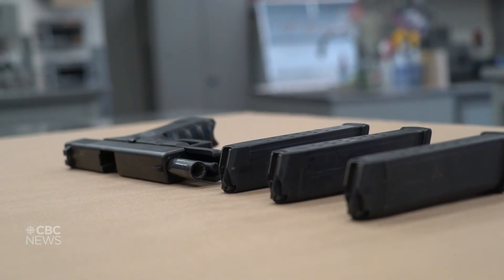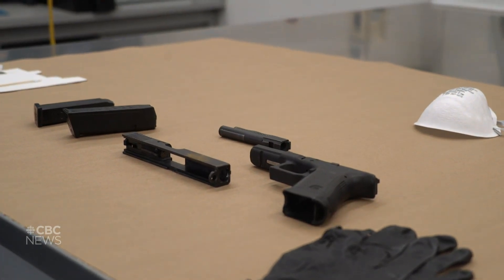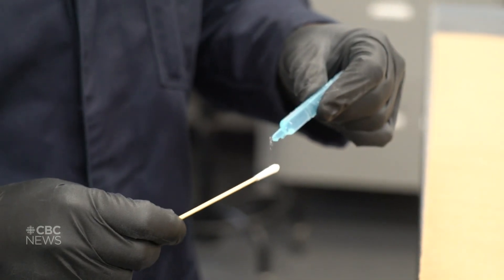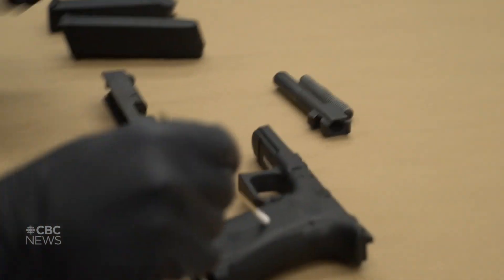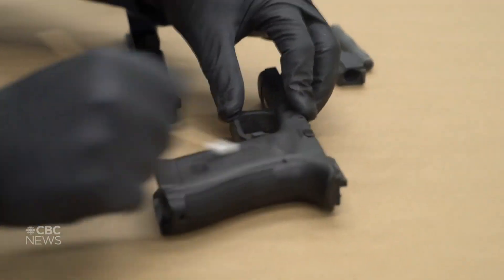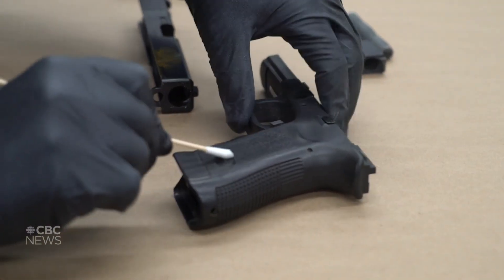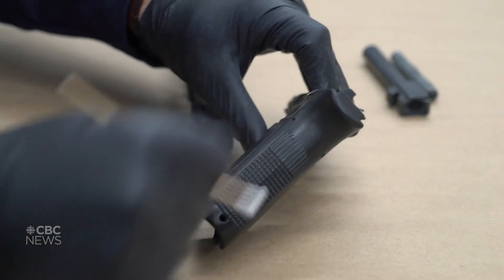This is one of our firearms — not a piece of evidence, but just for our purposes today, it's one of our Glocks. DNA is a huge part of the forensics; that is my first priority. That essentially entails swabbing of firearms — getting a little bit of moisture on there and then rubbing off all the skin cells that have been sloughed off by the hands through the handling of the firearm, specifically on the grip.